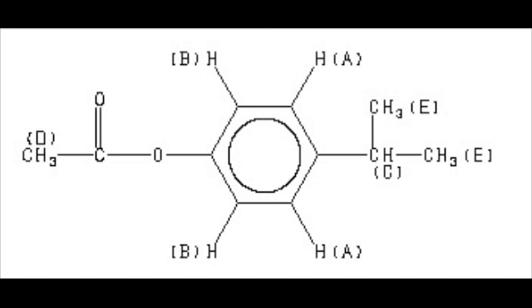So now, look at carbon C there. Carbon C, although it contains only one hydrogen itself, is adjacent to carbons carrying 6 protons. That's quite a few. So right there we're looking for a multiplet on C, and more particularly on both those carbons with hydrogens marked E, we're going to be looking for a doublet because they're both adjacent to C. So I guess what I want to do now is draw a general observation.